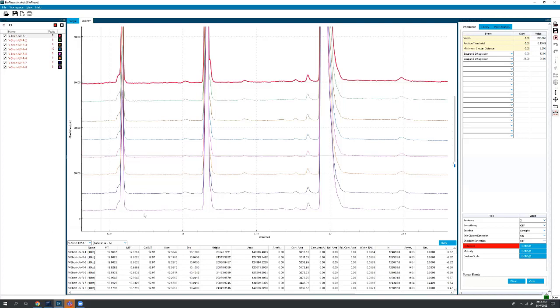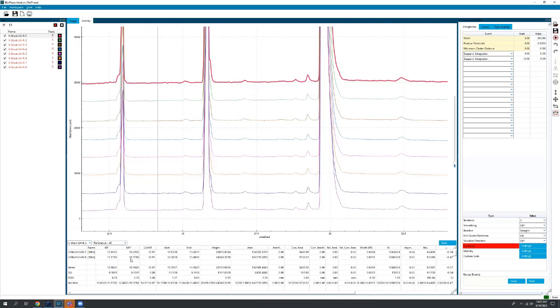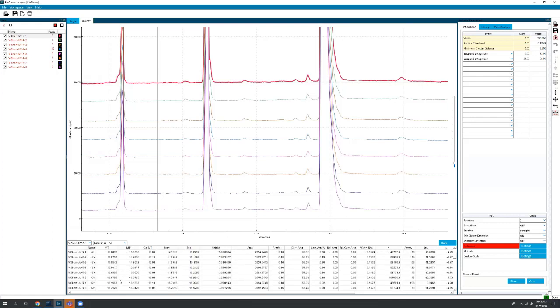One of the nice things about this overlay in the software is we can get some very simple calculations. Maybe not so simple for a person to do, but for software to do, it's sort of what we come to expect. So we can see RSDs for our named peaks here. This is standard deviation. You can see min and max.